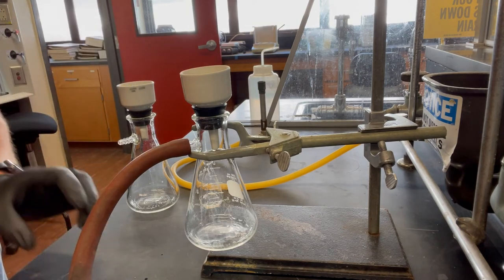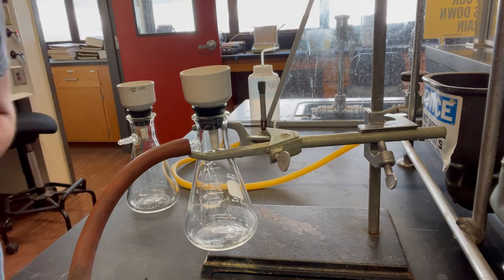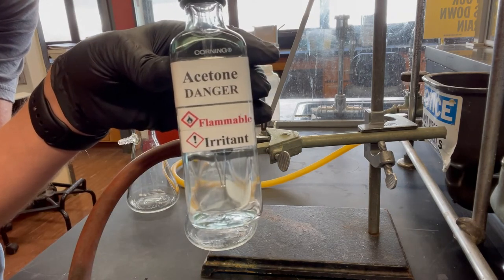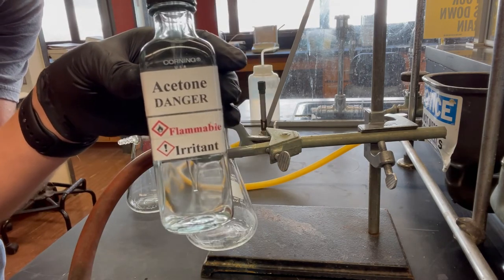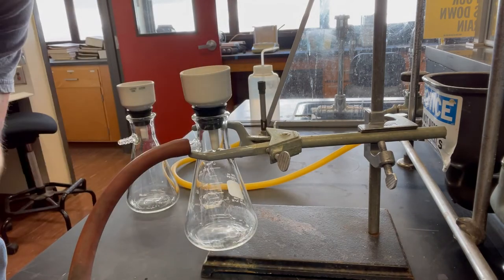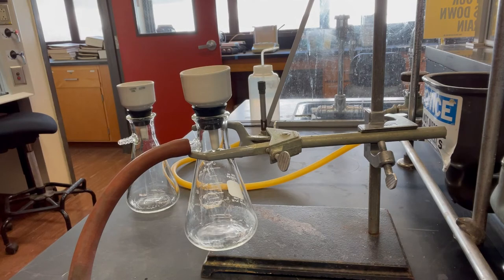We're gonna add a little drop of acetone, so watch your nails. You just got them done. But yeah, that's gonna dissolve our sample. We're gonna spot them on a TLC plate, throw them in the chamber, this chamber right here, and then see what happens.